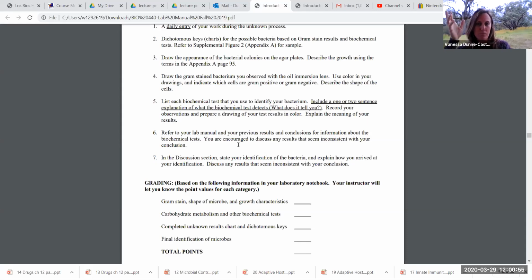If there is, then switch the test. You can ask me and I'll give you permission to do it, but see if you can do that first. And if you really can't, then do the best job you can. Obviously, you have many resources available to you, Google and your photographic atlas, to help interpret those results. But discuss any strange results that you come across.